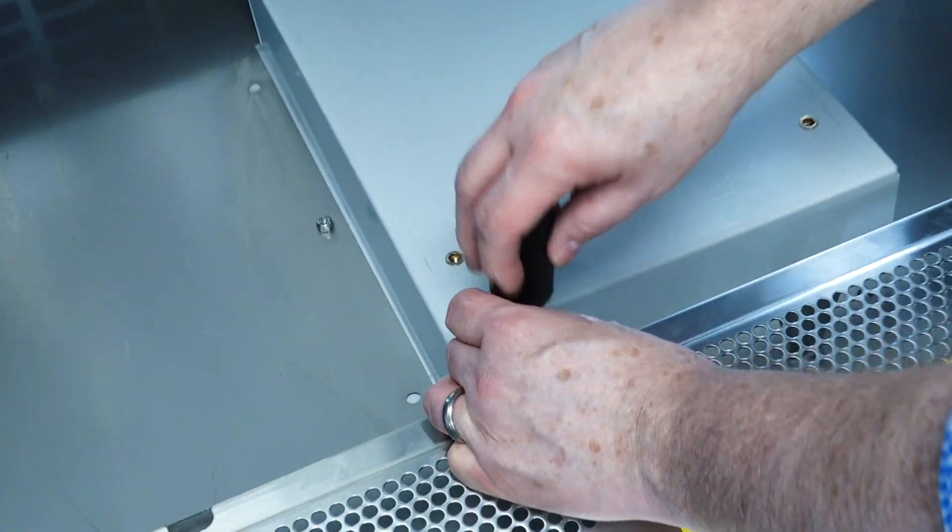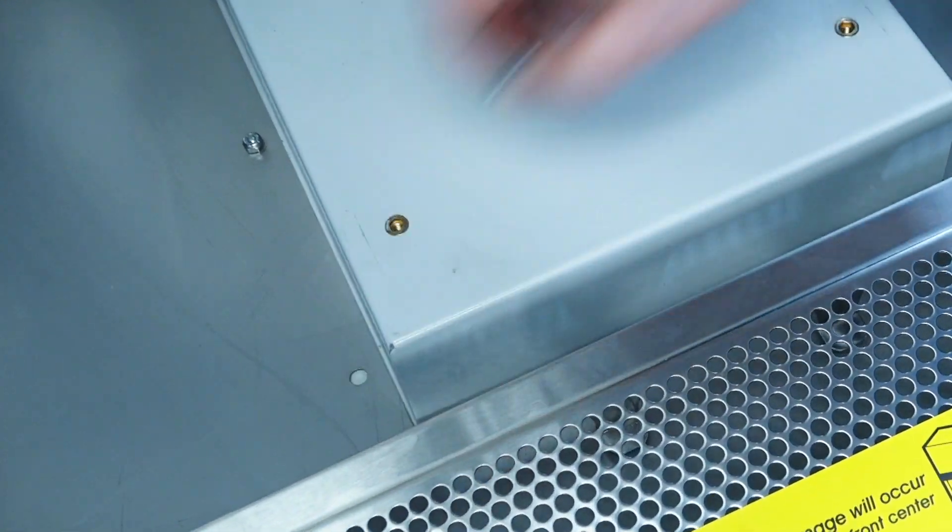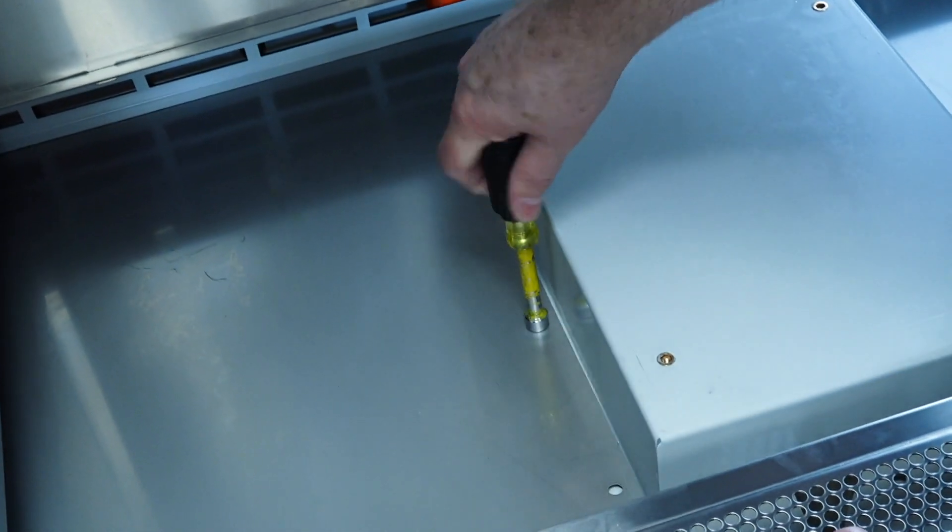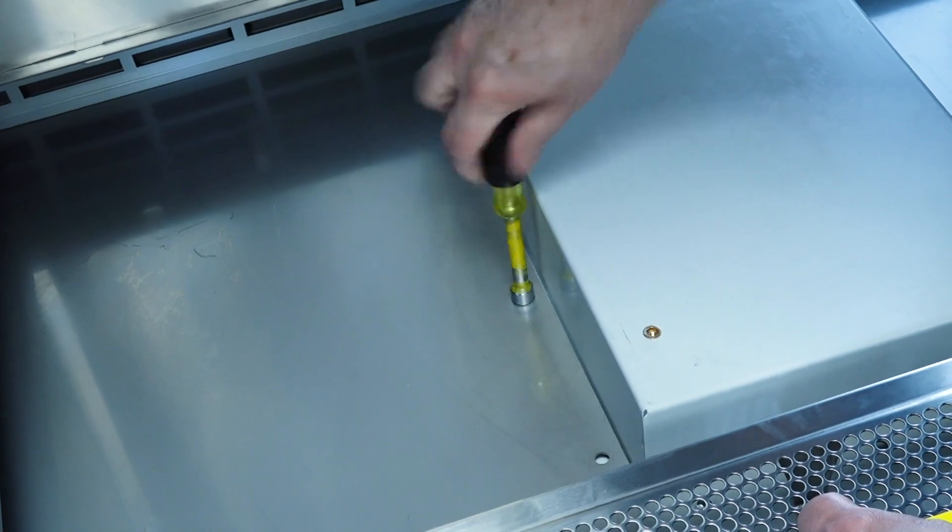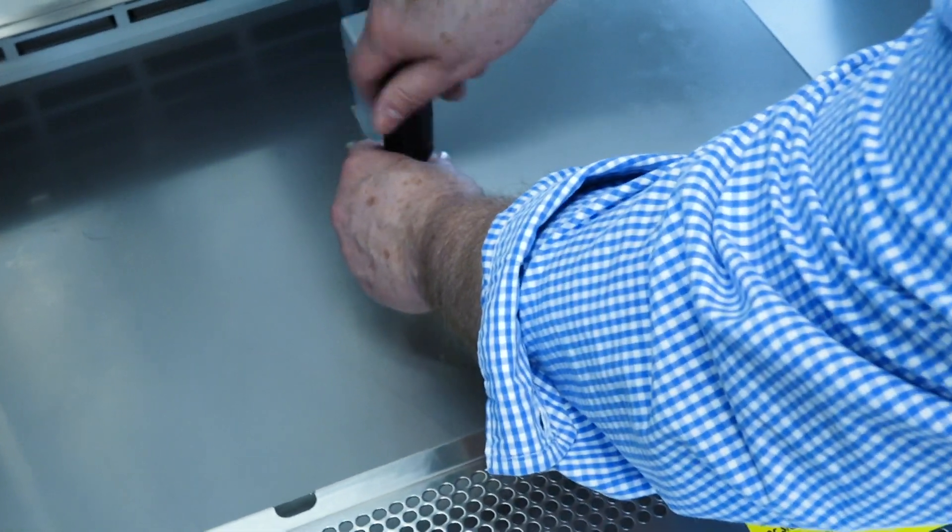Next, remove the shipping support by loosening four nuts. A three-eighths inch nut driver or wrench is required for this step. The shipping support and securing nuts can be discarded at this point.